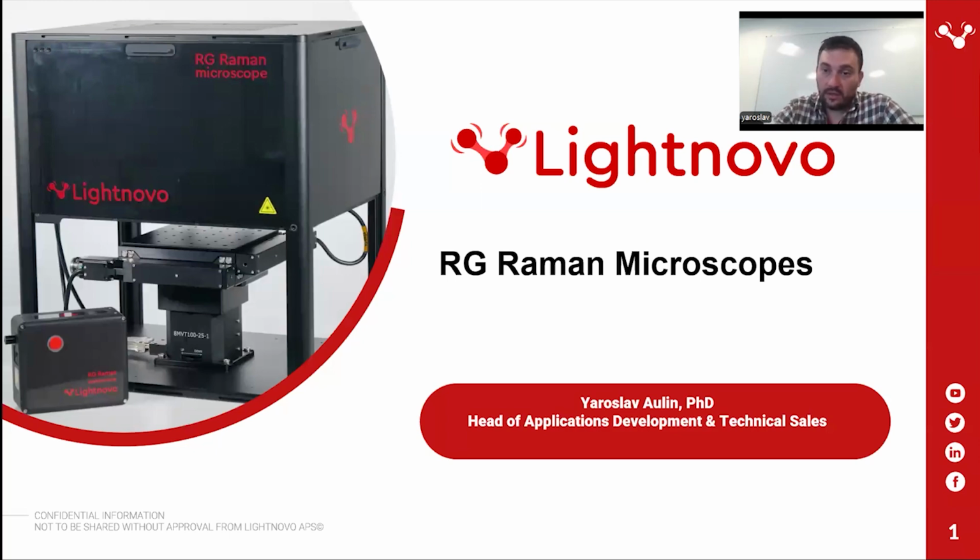Next question, I think from the same user. Can we overlay spectral image and visible image? Actually, we are working on this feature in the software, and it will be implemented soon. So it's not available yet, but soon to be implemented. Hopefully by the end of the year.